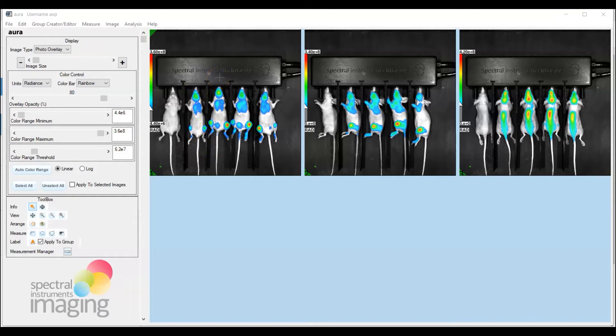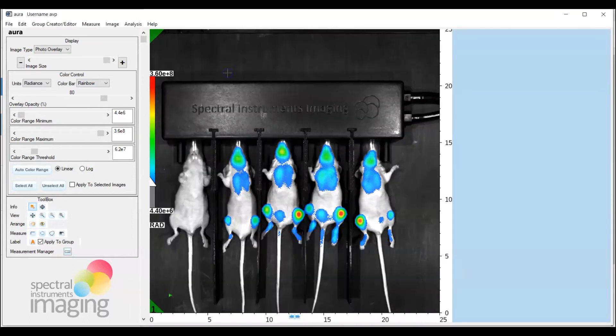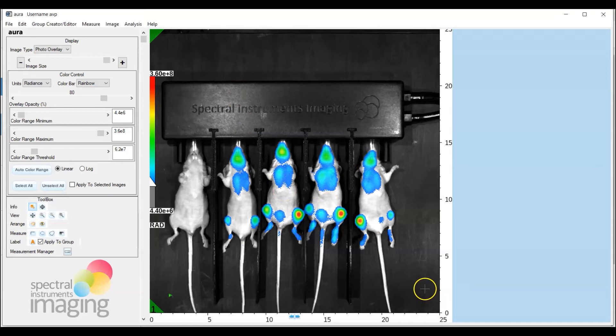Now to draw these ROIs it's easier if you expand the image. So the easy way to do that is to double click on the image and it expands to the full height of the analytical window.